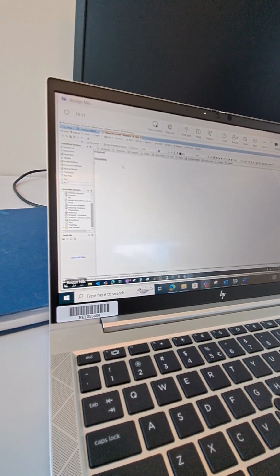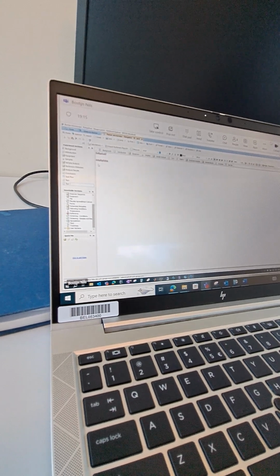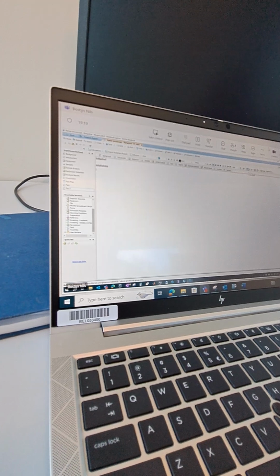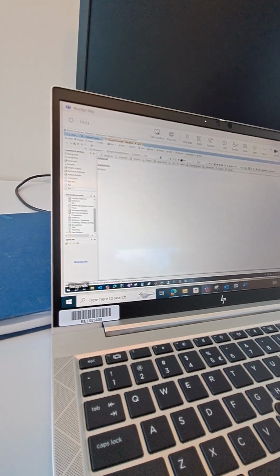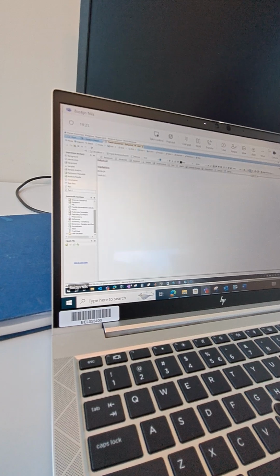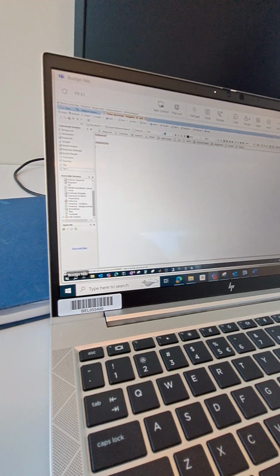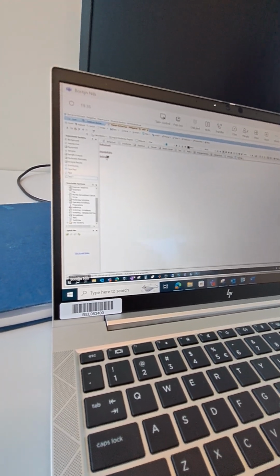Sorry, you have added the date and time manually, yeah? You haven't pressed any button. No, I have added it here, insert date. Okay, fine. And then it's automatically giving the date of today. And when I do time, it's giving the time of now, the exact time. Yes. So here, it's very flexible. You can type, you can give it another color.